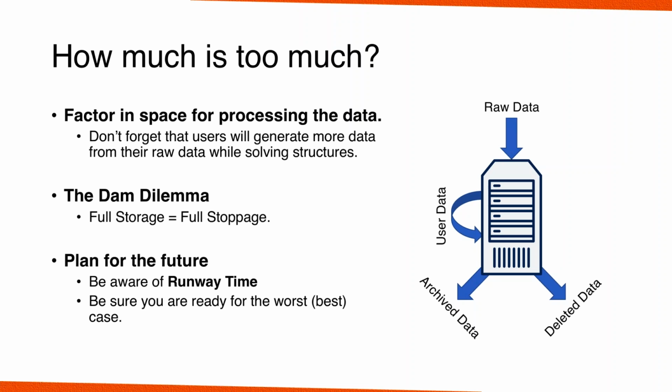I haven't seen it yet. I can't wait for it to happen. So you always need to be aware of how much time you have before your reservoir overflows or your storage fills up. And you need to be ready for what to do when that happens. And you always should be planning this for your worst case of collection, your worst best case.